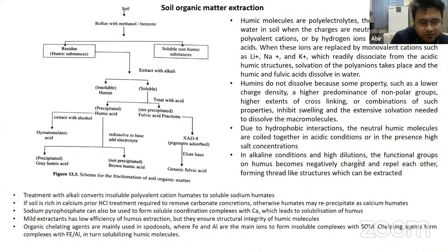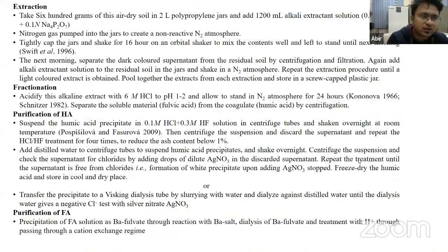And similarly for fulvic acid, we can pass it through an ion exchange regime, and we can elute the pure fulvic acid, means hydrogen saturated fulvic acid. So that is the purification step, and I have actually given you the step-by-step process here.